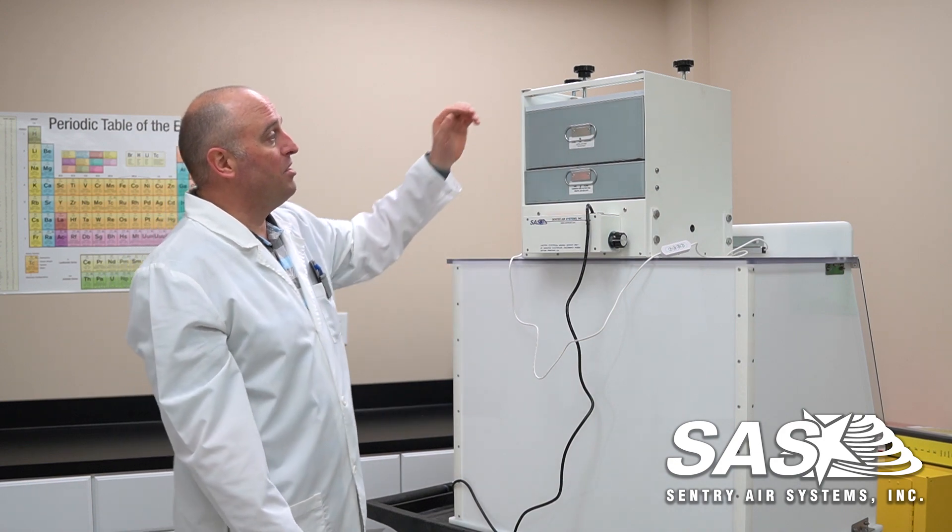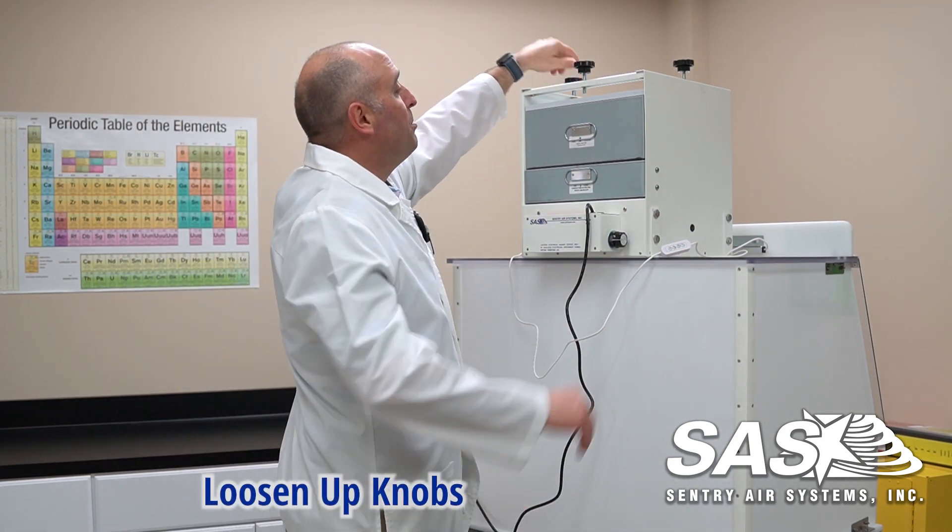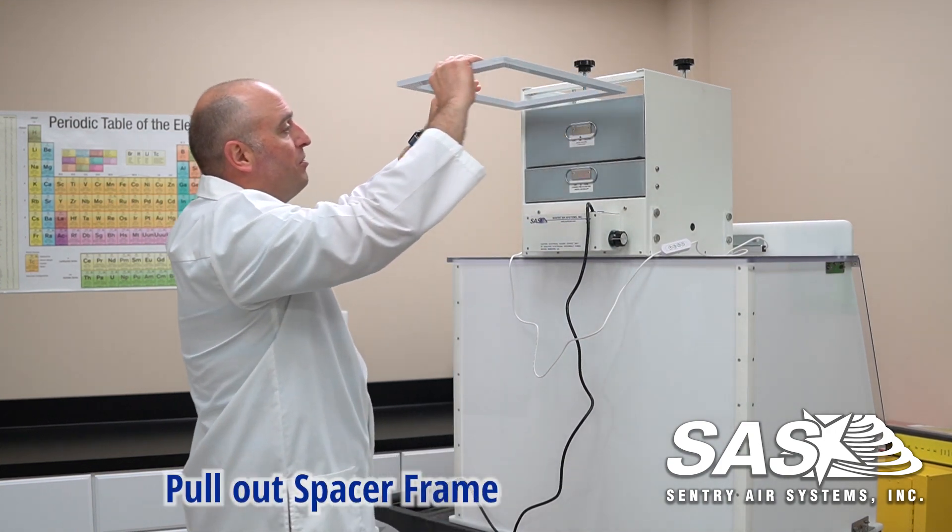From here it's a pretty fairly simple process. You want to unlock the unit, loosen up the knobs up top here, and pull out your spacer frame.